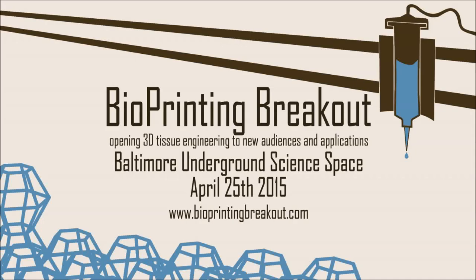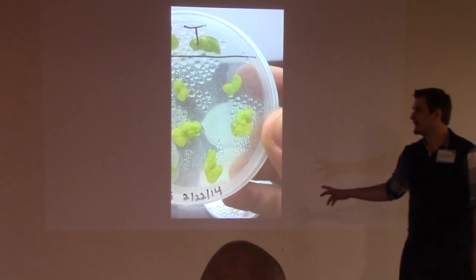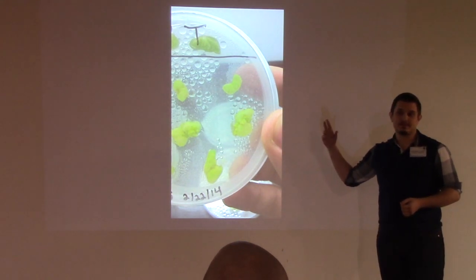Now you've transferred those leaves onto a media containing antibiotics that kill the bacteria. You want it to do its job, not take over the plate. Because what's in the plate is sugar and carbon source that life requires, so it's going to flood the plate and it reproduces faster than the plant, so it'll kill it, then you're competing for food. So when you plate these things, you plate them not on regular media, but media containing hormones to do the regeneration, which we spoke of, as well as a herbicide, which is a natural selection marker.